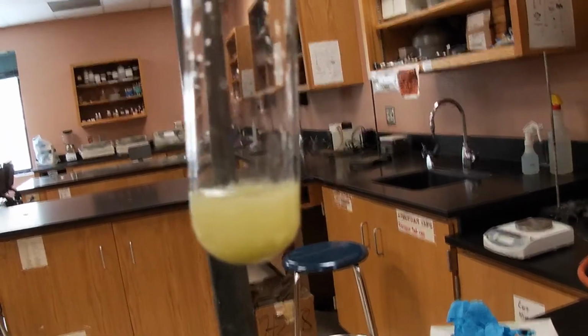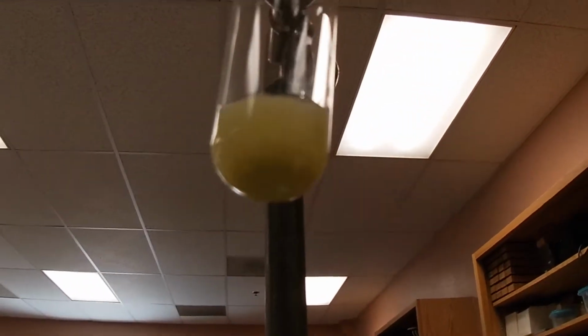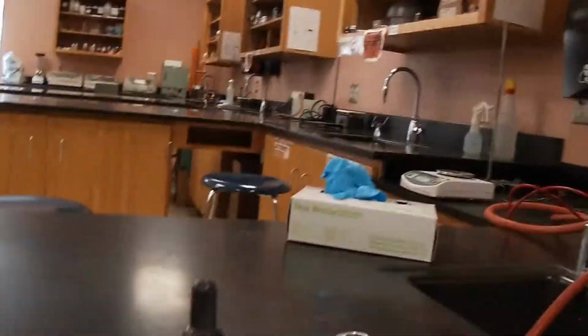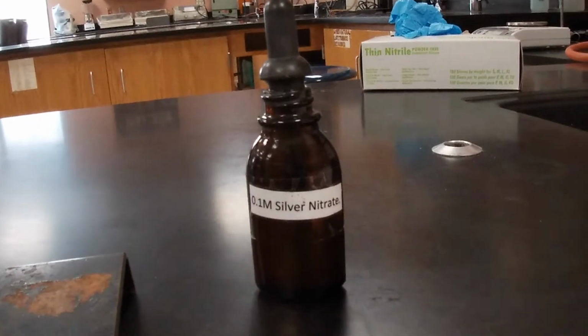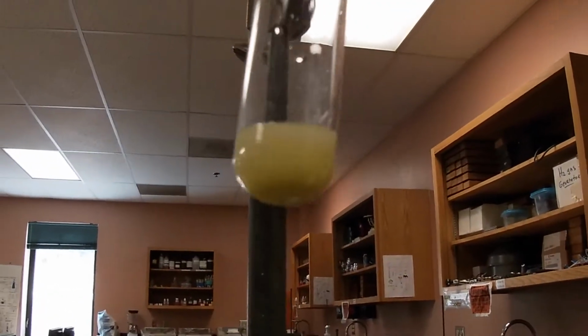Here we have our yellow substance. It did cloud up. It is cloudy, it is yellow. And if you can see the bottom of it, you'll notice some settling of that solid, or that precipitate. So here again, this is a reaction between silver nitrate and sodium phosphate, and we end up with this.